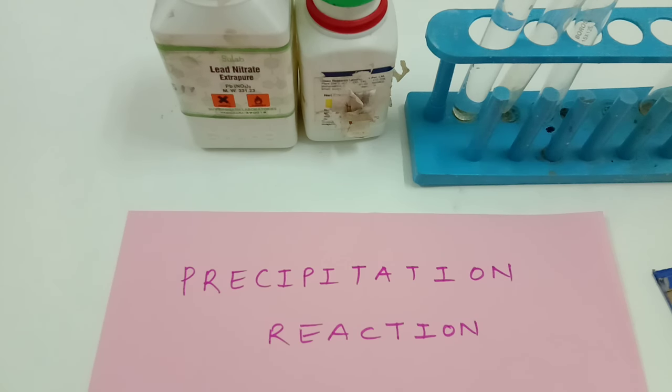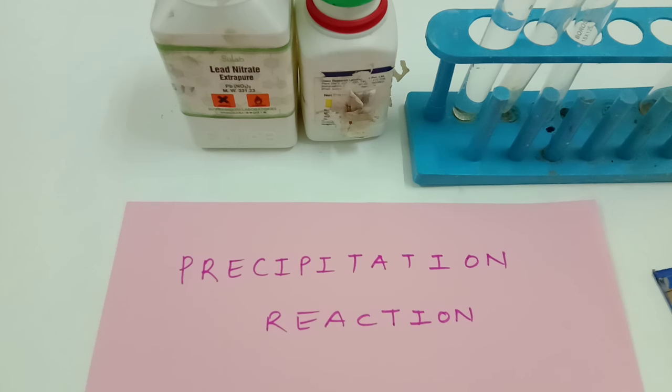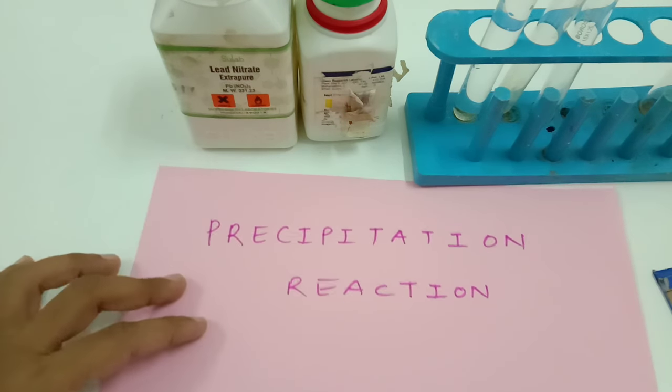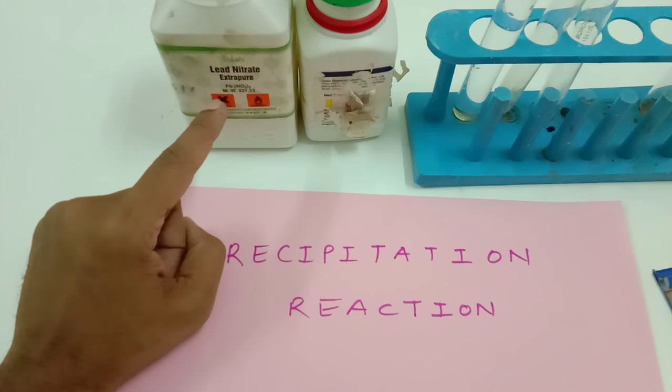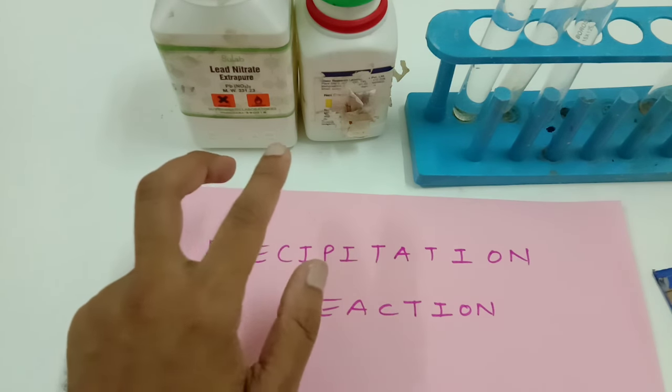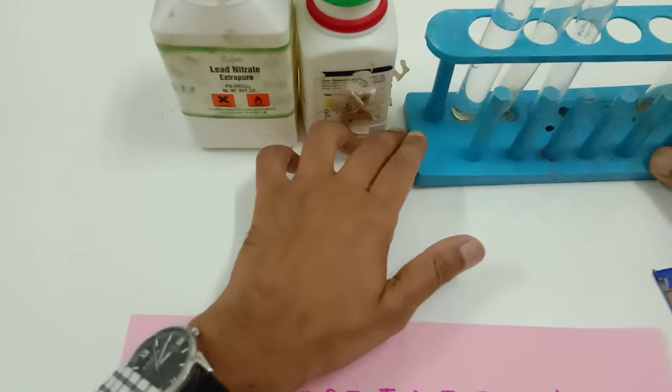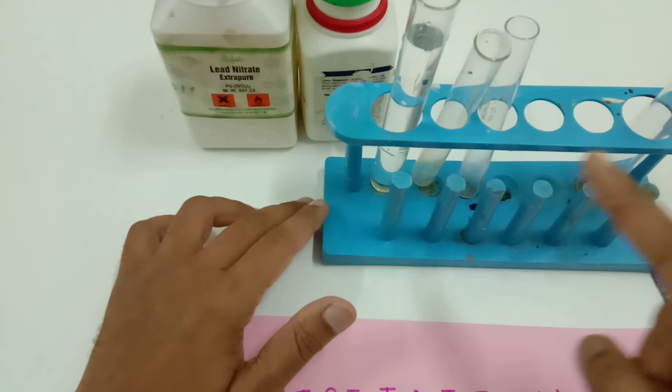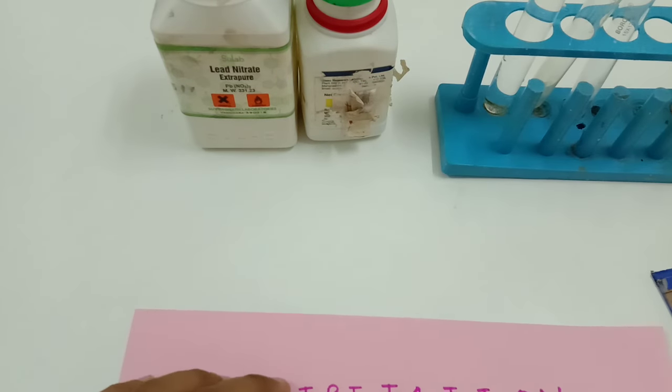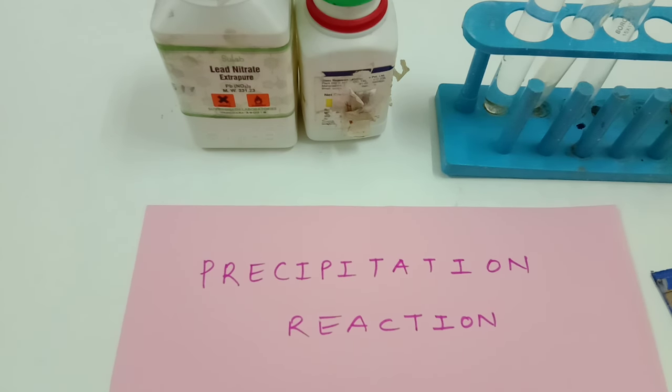Hello scientific people, how are you today? Today I am going to demonstrate a precipitation reaction between lead nitrate Pb(NO3)2 and potassium iodide. Both of them are white colored salts. What else do we require? We require a few test tubes and some water. So let's begin the experiment and then we are going to go inside the details of the reaction.